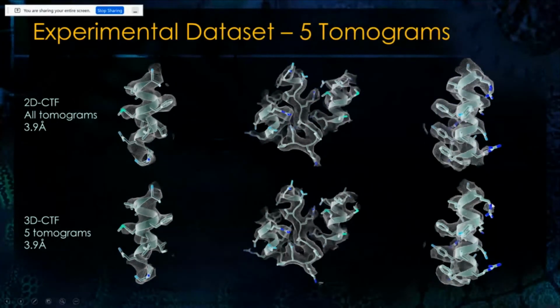And sometimes we also lost a bit. But still, for us, it was a very important result to know that we actually could get to the same resolution and, most importantly, to the same structure using only 10% of the data when we really did the processing properly.